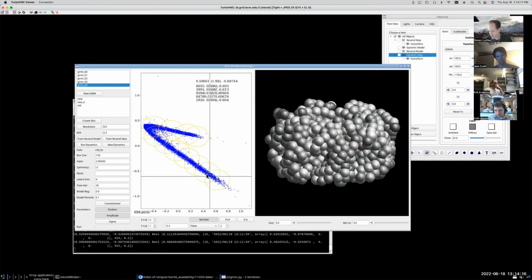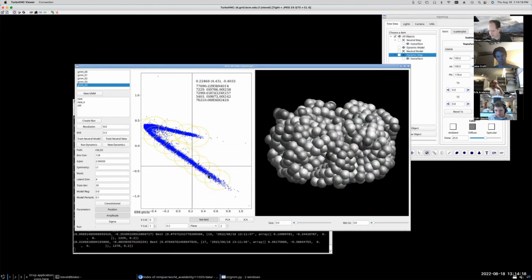So here, I can drag my mouse around freely and I can generate one of those Gaussian maps immediately, very quickly from any point in space. But if I want to compute maps, I have to actually do 3D reconstructions for each one. And it's not too bad here for 1,000 particles. I can compute them very quickly, particularly if I downsample a little bit.